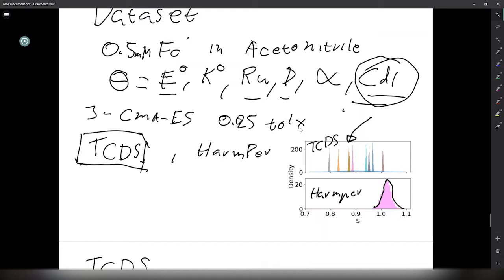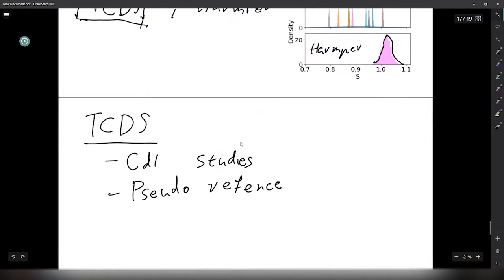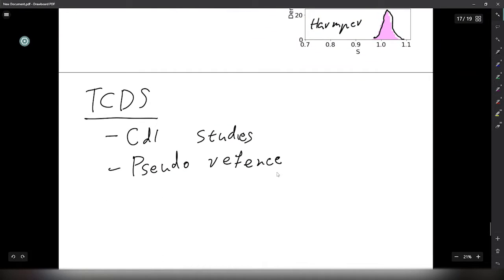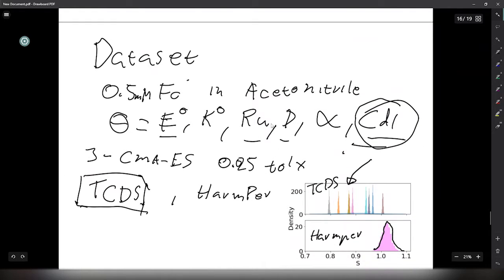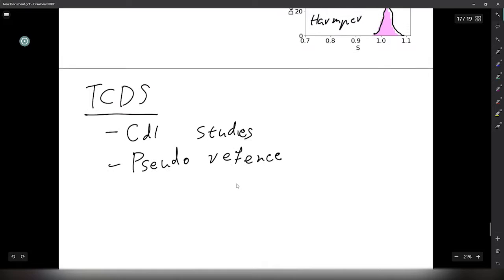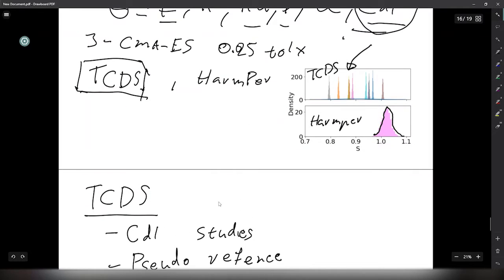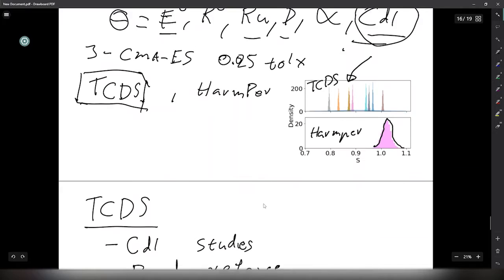Yeah, I find the TCDS is very likely to just couple strongly between two parameters, where FTA-CV only really happens for free. Other things that occur, so you probably, for CMA-ES, you're not going to see that, but when you apply that for Bayesian inference, you're going to see that happening quite a lot. It's just for coupling of parameters causing really weird distributions. Because when you find a point solution, it's quite easy, but when you find Bayesian inference, it isn't.